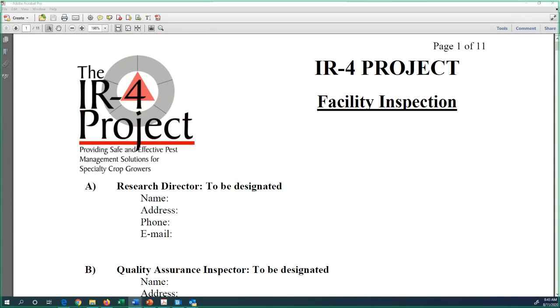That's how you maintain the integrity of records. But the archive, a lot of the time, is not locked. Same thing with freezers. You need to control access to samples. A lot of times we find that either there's no log on a freezer for removing and replacing samples, and the freezer is not locked, or there's no restriction on access to that freezer.